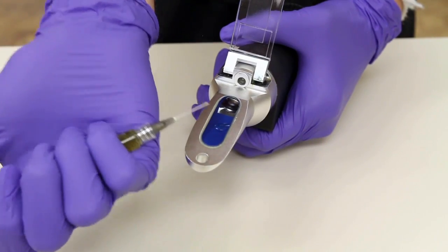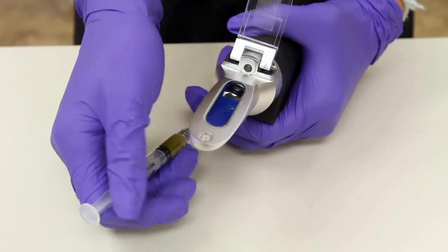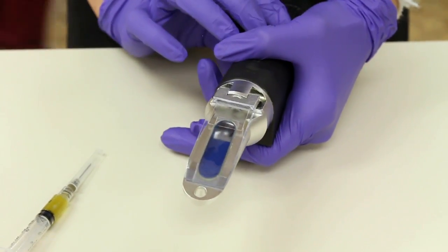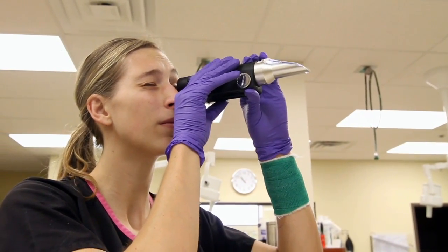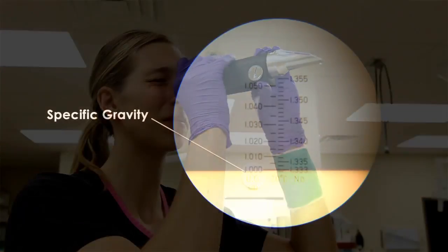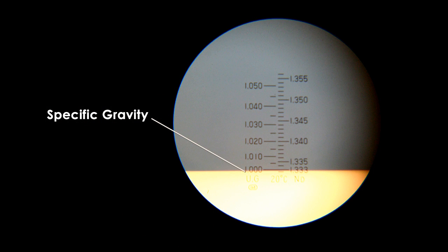Begin by placing a drop of urine onto the window as seen here. Close the cover window and read the results with the refractometer in a horizontal position. Adjust the focus until a clearly defined horizontal line appears, then read the value printed on the specific gravity scale.